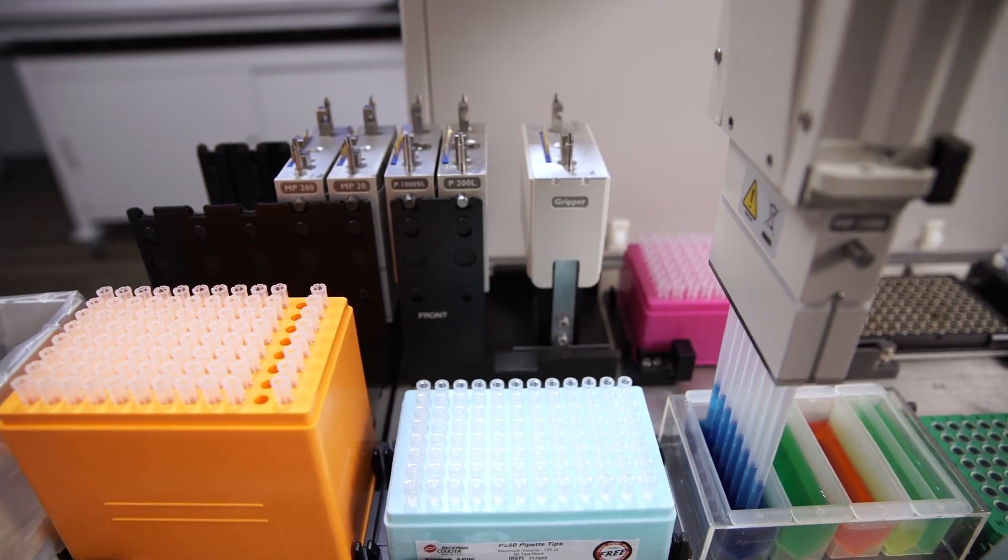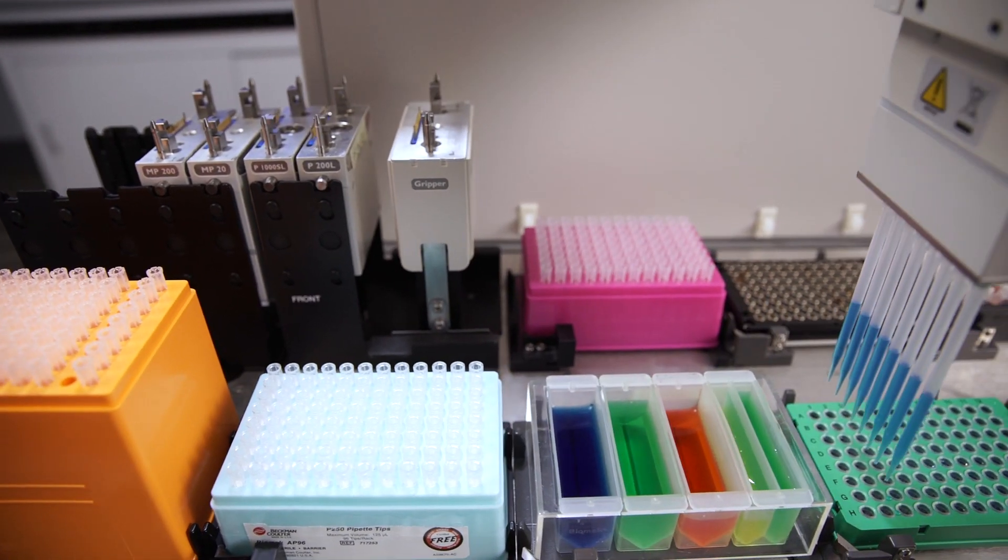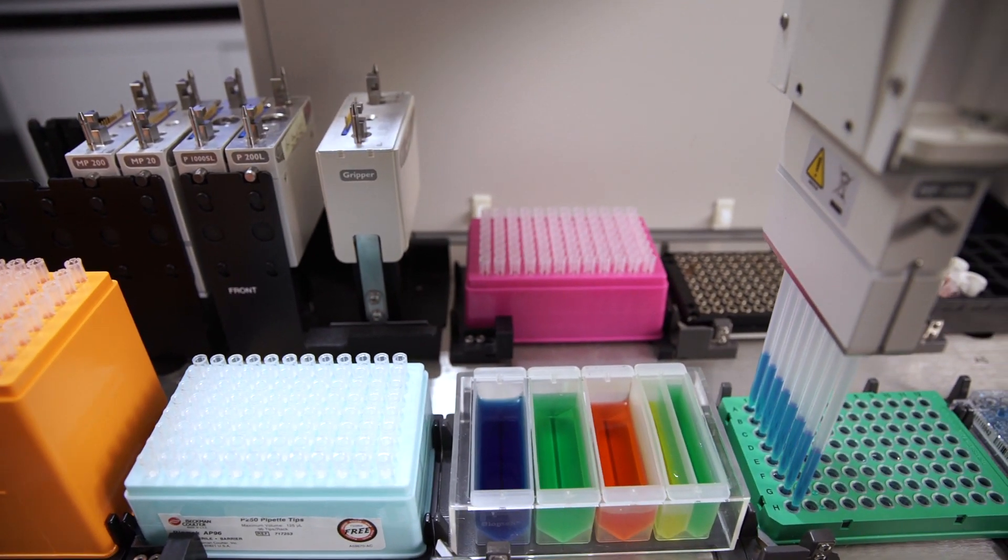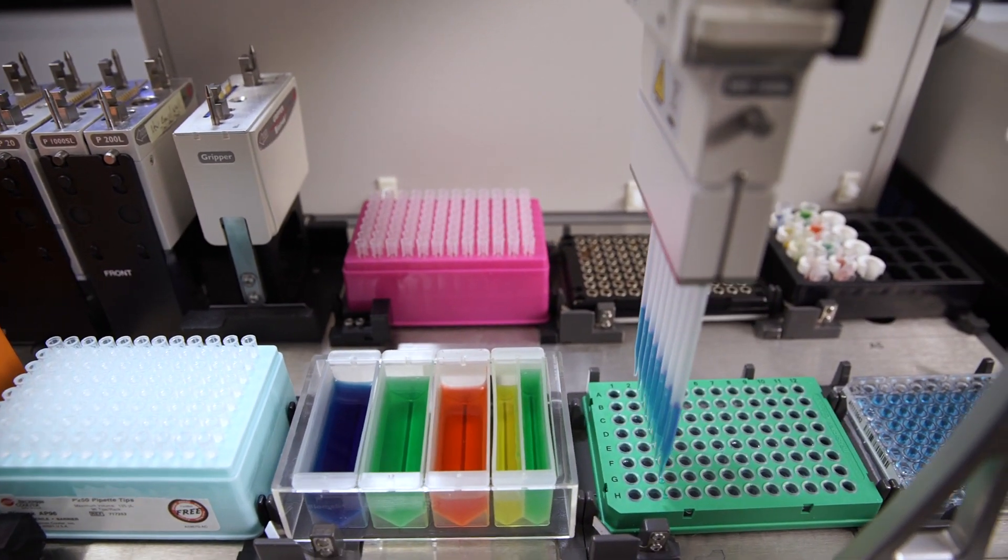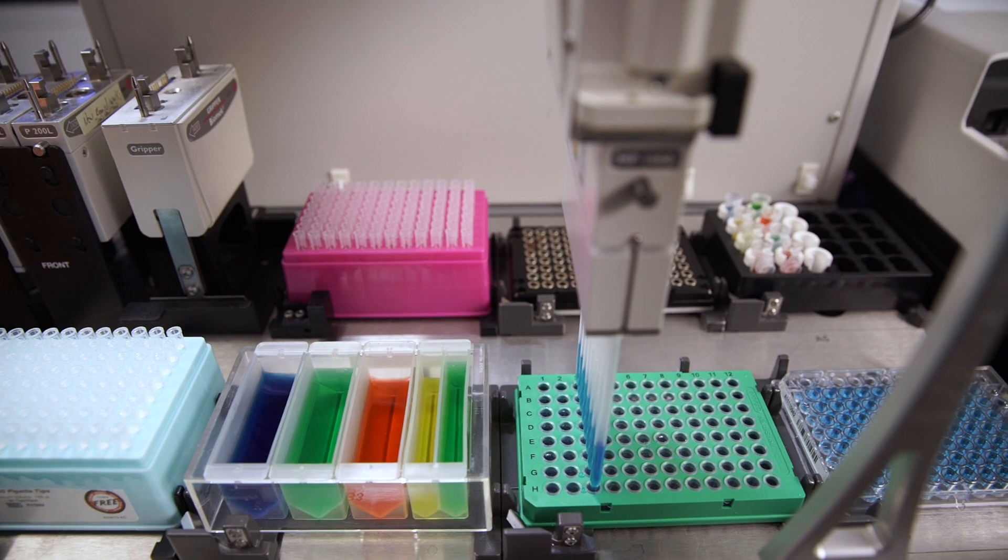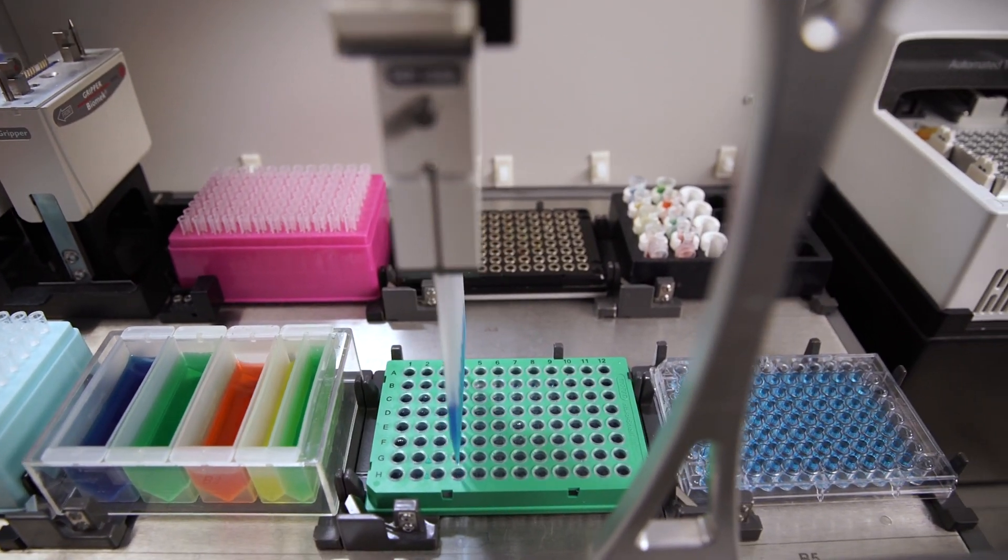The Biomech 4000 optimizes deck positions for critical labware while providing a more efficient workflow, less hands-on time, and extended walk-away time.